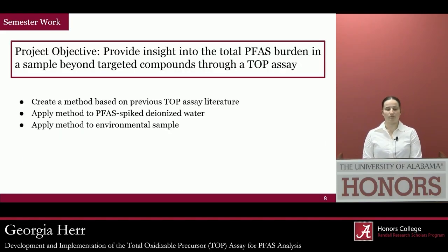So the overall objective of this project is to provide insight into the total PFAS burden in a sample beyond the targeted compounds through a TOP assay. The three sub-goals of this project are to first create a method based on previous TOP literature, and then apply this method to PFAS-spiked deionized water. Finally, after perfecting this method with DI water, we hope to apply the method to an environmental sample.